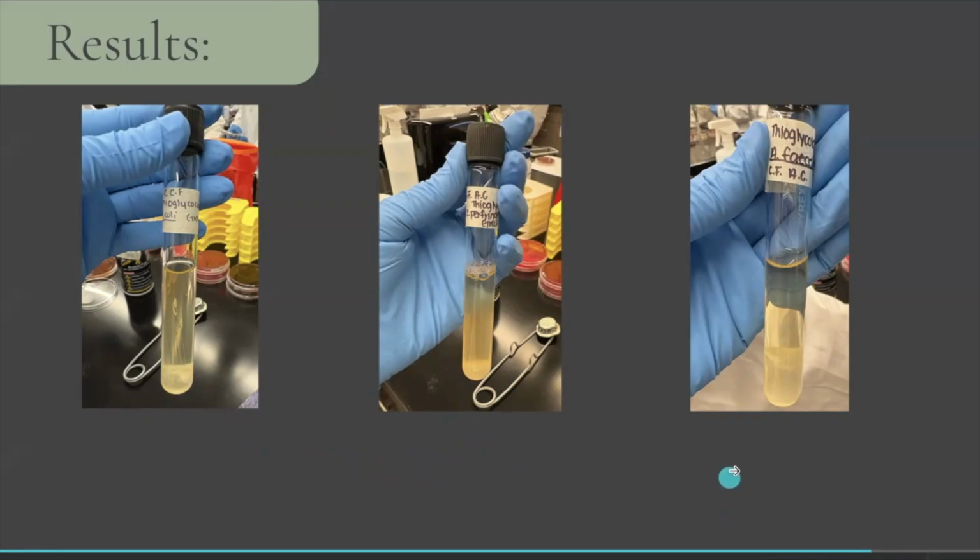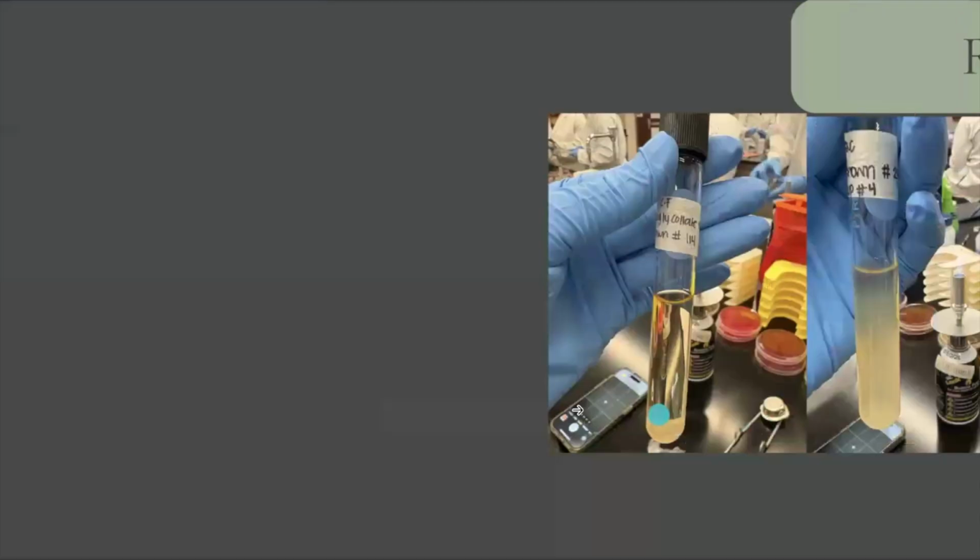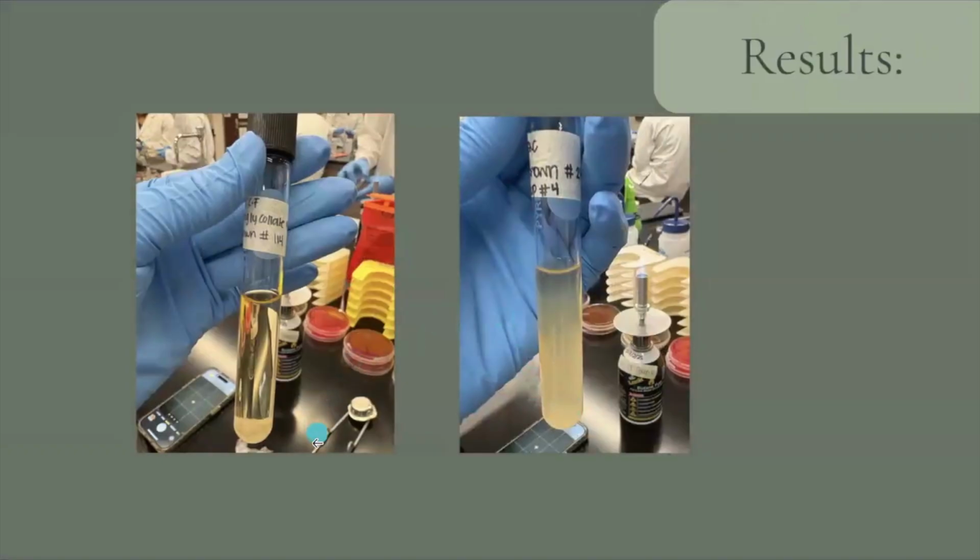And then for S. faecalis, we see growth throughout, but it should have been denser towards the top as well. And for unknown 114, we see growth more at the bottom. And then our unknown 294, we see growth throughout.